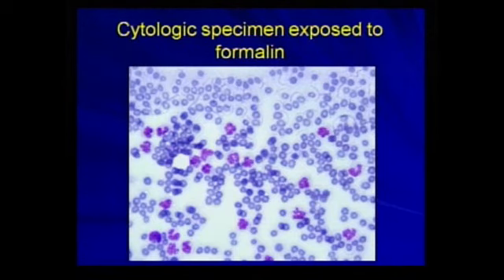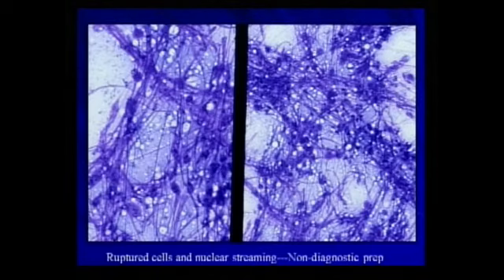And this is what those cells exposed to formalin look like. You can't get a look at them. They're sort of bluish green and very hazy. You can send this slide to IDEXX. You can send it to Antech. Just don't send it to me.